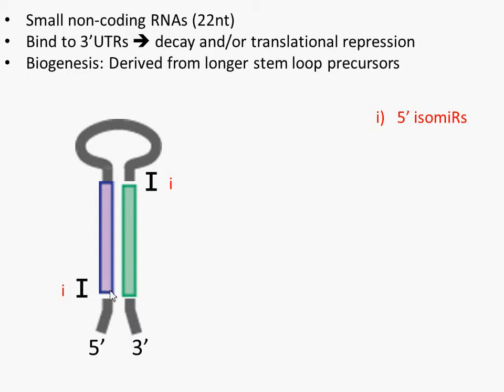Now just note that the default setting for the miRspring document is that a microRNA is considered to be a mature form if it starts within 7 nucleotides of that defined by miRBase. So that is any sequence that starts as defined by miRBase plus or minus 3 nucleotides, giving that 7 nucleotide window.